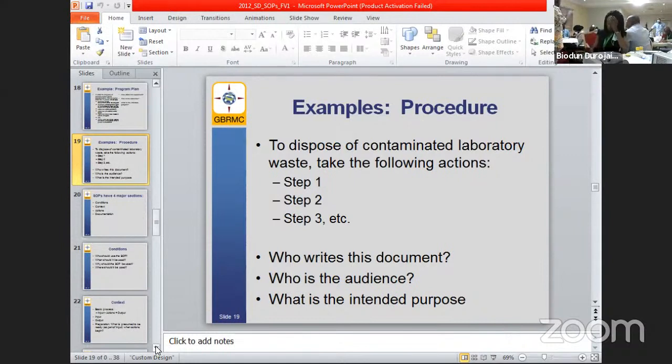That was what I said: different set-ups may play out in different facilities. There are some facilities where you don't have a lab manager or a safety officer, so the responsibility can still fall on the overseeing staff. But where you have some specific role assigned, maybe even sub-managers in the lab, you can see such experienced people in those areas producing the document. But as I said, in terms of ownership, it is the lab manager that actually owns the document at that level.